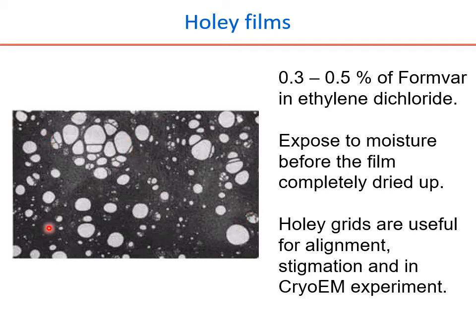What you are seeing here is a holey film coated with carbon. How to coat the holey film with carbon is the subject for the next slide. We will be discussing that in a minute.